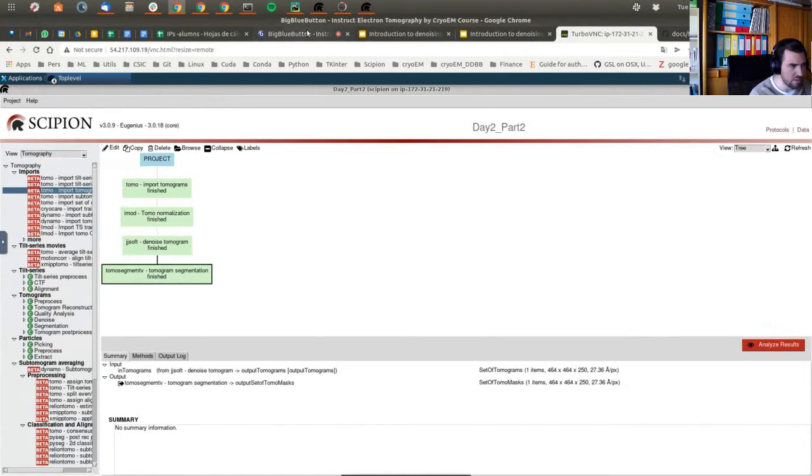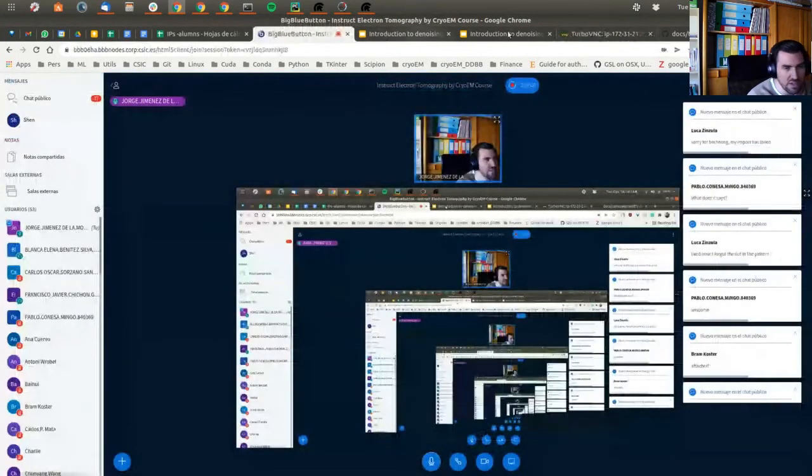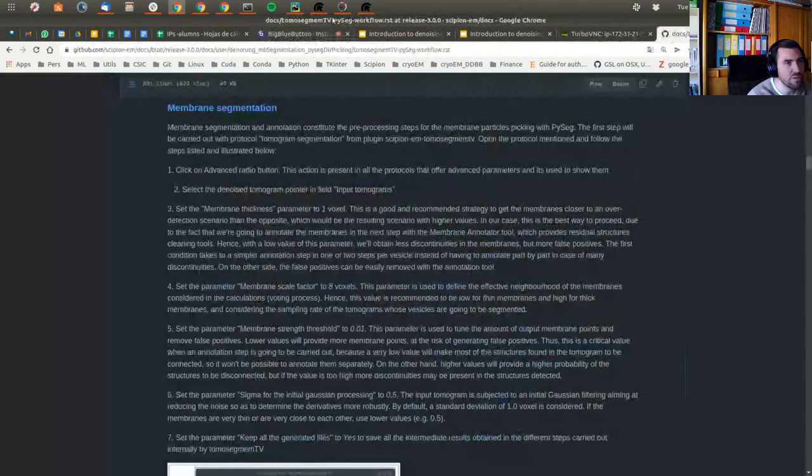Is it okay? Let me check it out. I have here another window. Yeah. Okay. Thanks, Dimitri.